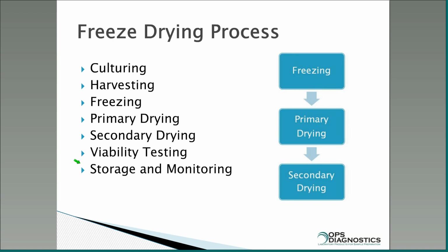There's a perceived notion that when you freeze dry something, it will last for years and years and years, and that can be true, but it's not always true. So you need to really keep an eye on whether these things are alive. And we're going to go over each one of these things in order here.